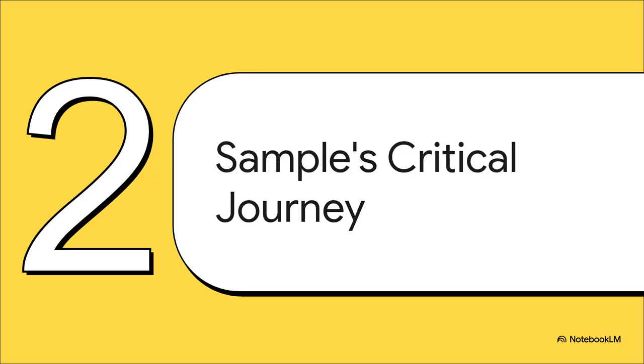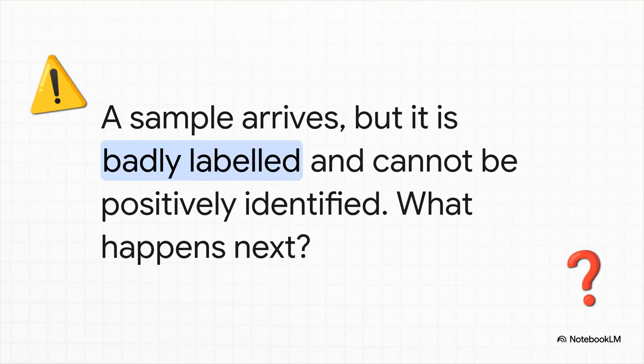All right, so the plan is in place. Now let's follow a sample as it comes through the door. From the moment it's received to the second it's put in storage, every single step is dictated by procedures. And all those procedures are there to protect one thing, the integrity of that sample. So let's play out a scenario.